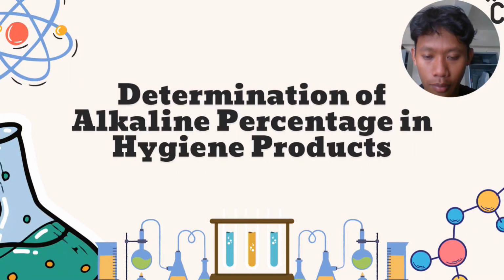Hi, so we will talk about the determination of alkaline percentage in hygiene product.